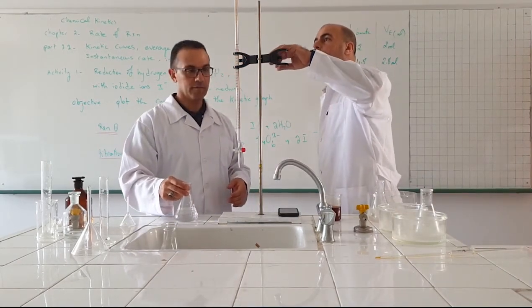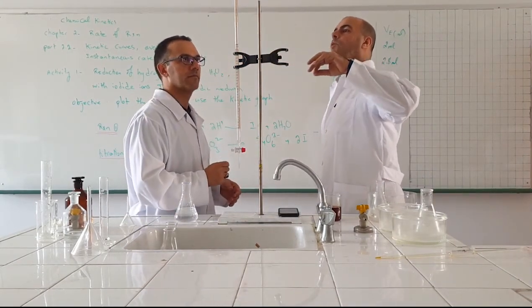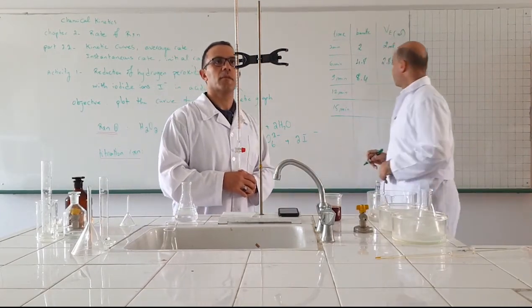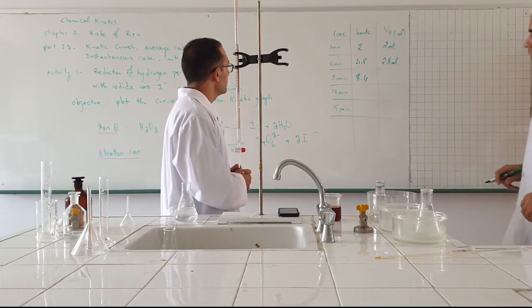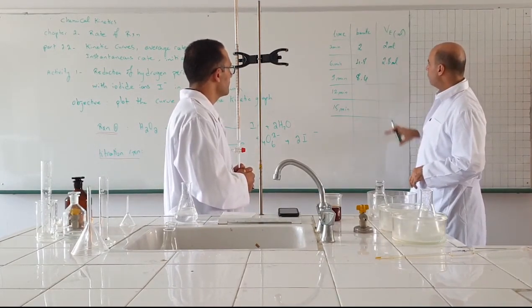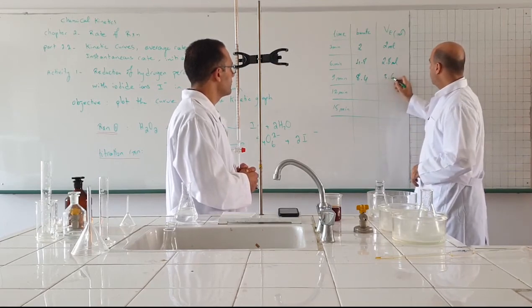After 9 minutes. Okay. The reading of the burette is 8.4. So, the volume at equivalence point is 8.4 minus 4.8, 3.6.